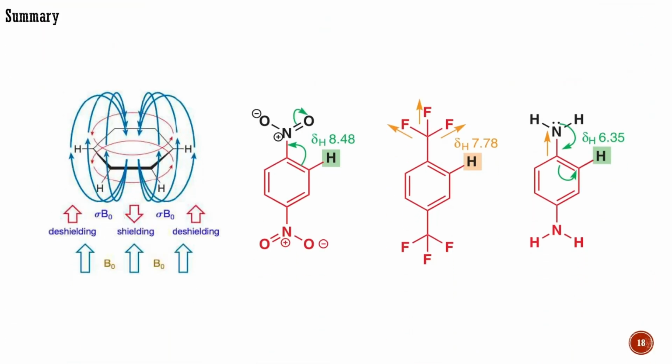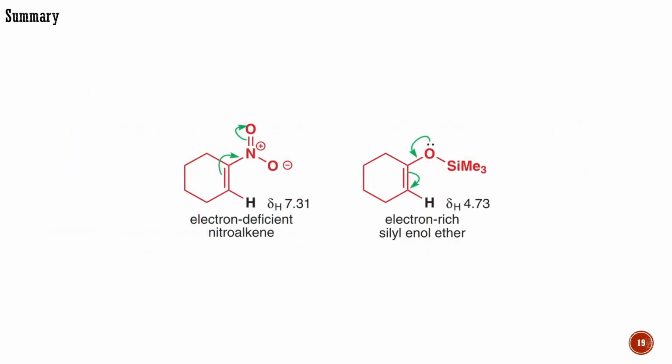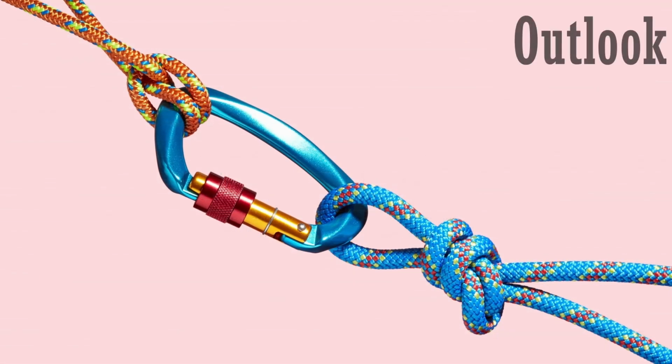To sum it up, in this lecture, you learned about the alkene and benzene regions of proton NMR spectroscopy. I discussed the reasons behind the deshielding effect of arenes and alkenes on the protons connected to a benzene ring and a double bond. You saw how conjugation and inductive effects affect the chemical shift of protons in substituted arenes and alkenes. NMR can be used to predict the reactivity of organic molecules and the selectivity of reactions involving certain molecules. The following lecture will concentrate on the proton NMR of the aldehyde region and the description of the chemical shifts of protons connected to a heteroatom.